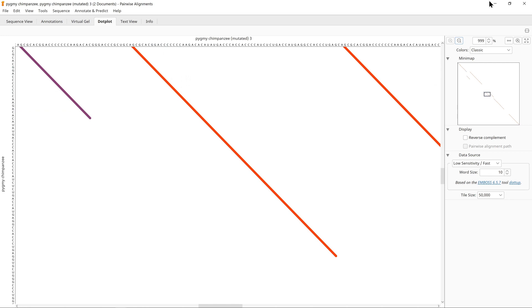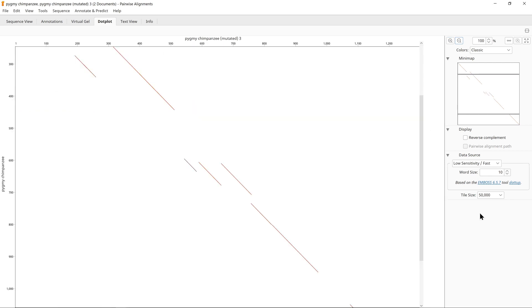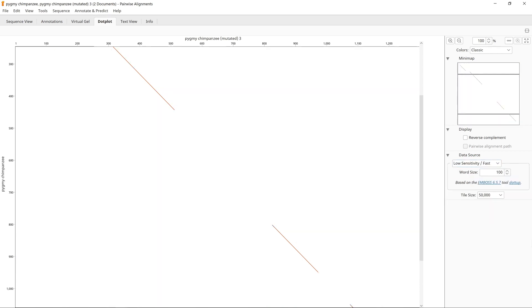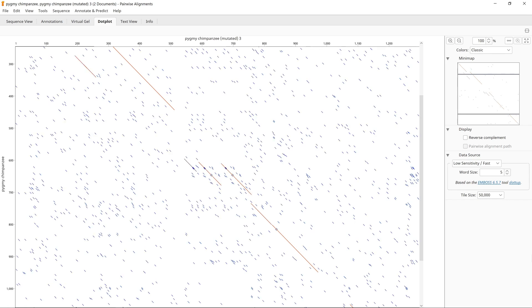Changing the data source settings will affect the dot plot. Changing the sensitivity setting increases or reduces the number of short noisy points in the dot plot. Increasing the window size will tend to fill the gaps between smaller diagonals to make longer ones.